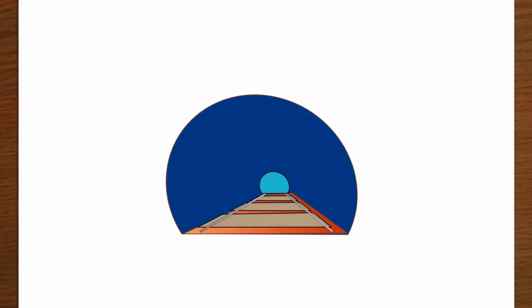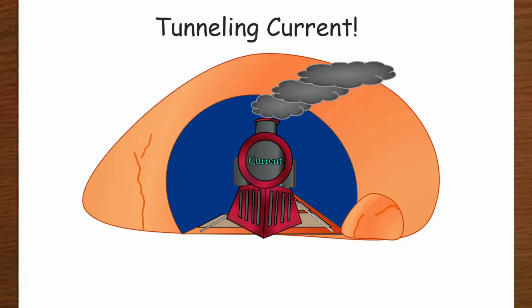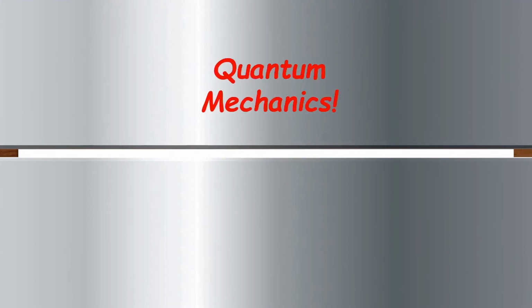To be more specific, an STM uses something called a tunneling current. This kind of electron current is the result of two conductors being brought really close together, to a distance close to the size of an atom. At this distance, an interesting quantum mechanical effect begins to occur.